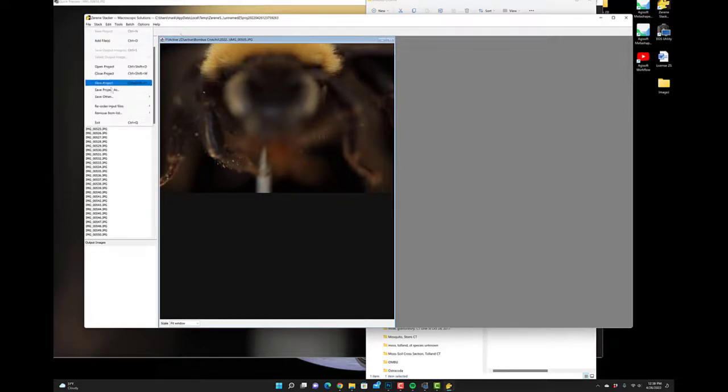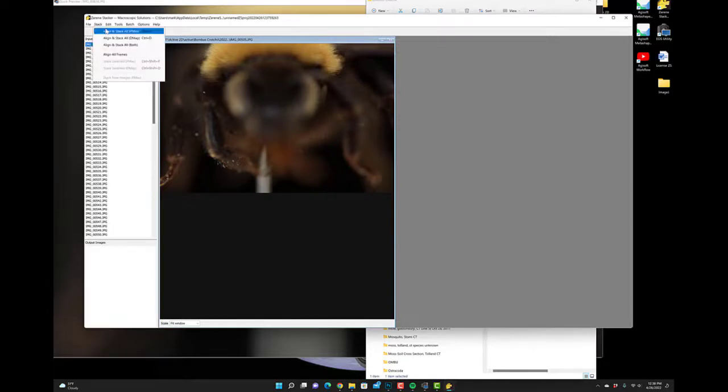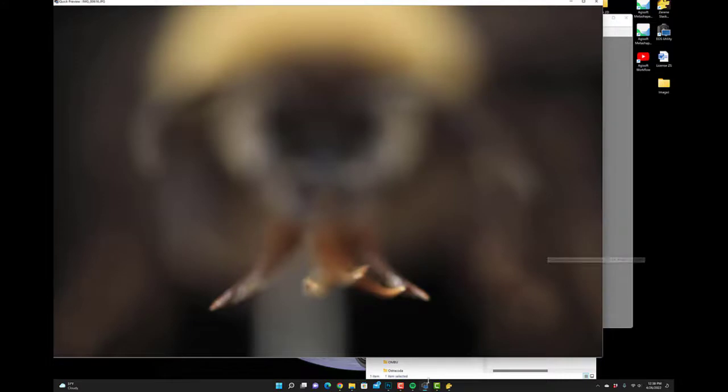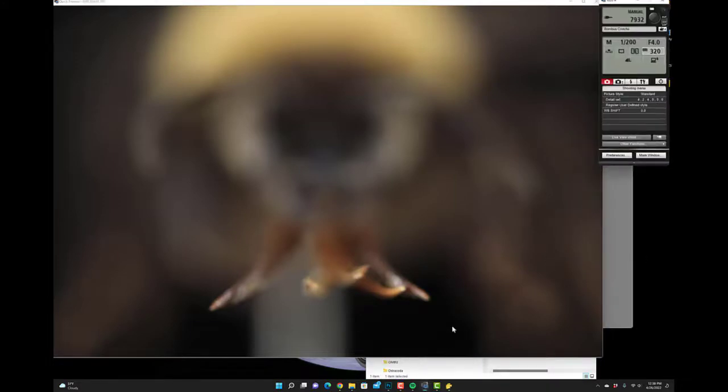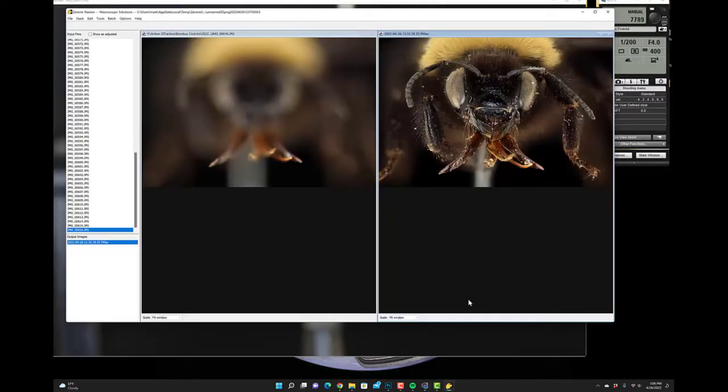In case you're new, one thing that I think is very important for everybody to turn off is make sure brightness is turned off and make sure automatic order is turned off. Okay, so we'll go ahead and align and stack all of these. While that's happening, what I'd like to do is step back the magnification a little bit and get a nice lateral view where we're going to have dark areas and light areas contrasted against a dark background.